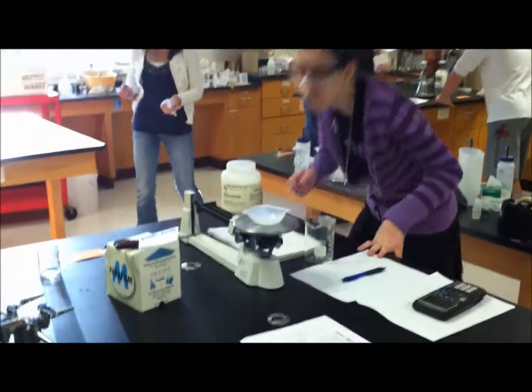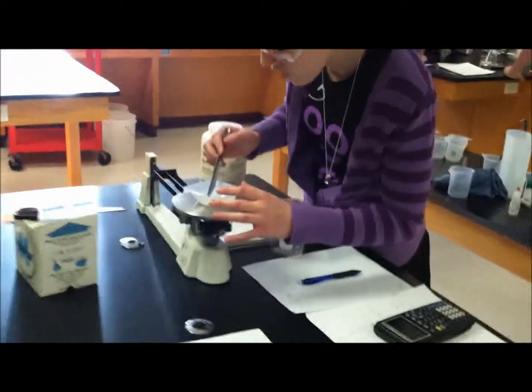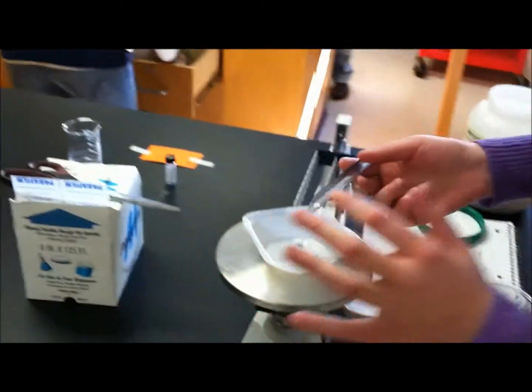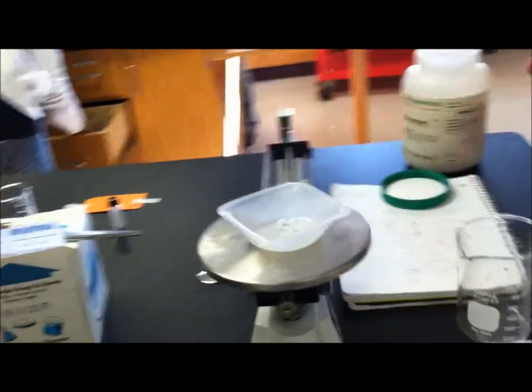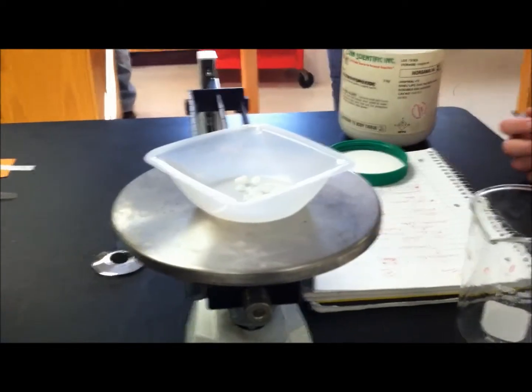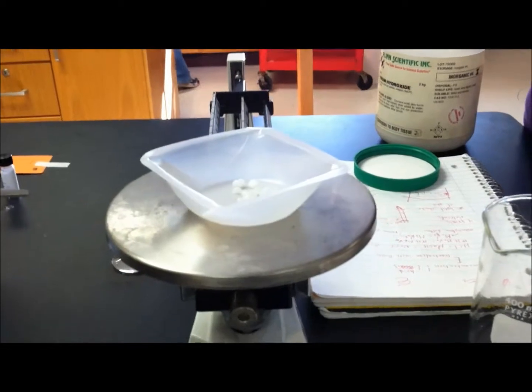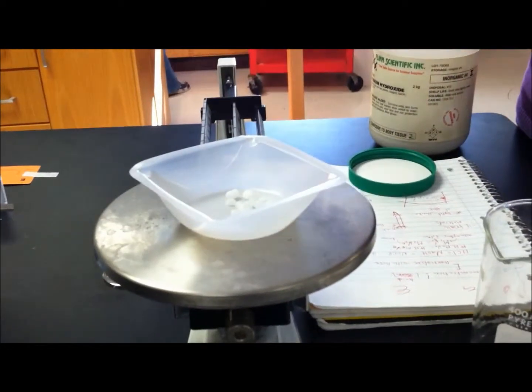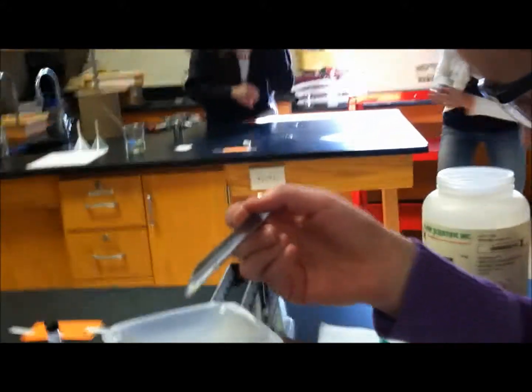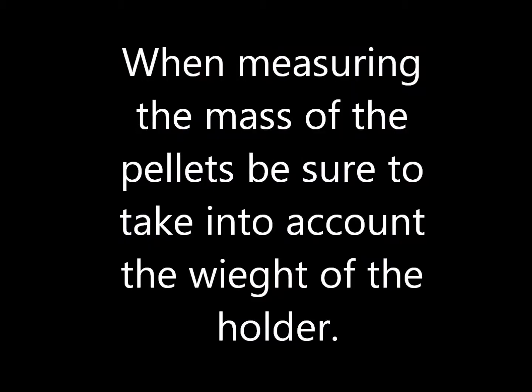So our first step for the titration of this experiment to find the molarity of the acid is to make our base. So right now Sky is measuring out 1.9 grams of sodium hydroxide. We are determining the molarity and the volume of the base that we want, and we'll be adding to the acid. And in the acid we'll know the volume of it but not the molarity. So we'll use proportions and cross multiplying to solve algebraically. So do we just about have it, Sky? 1.9 grams? Alright, that's the first step.